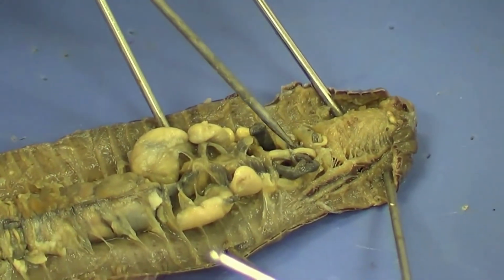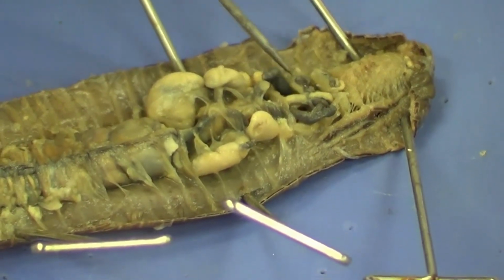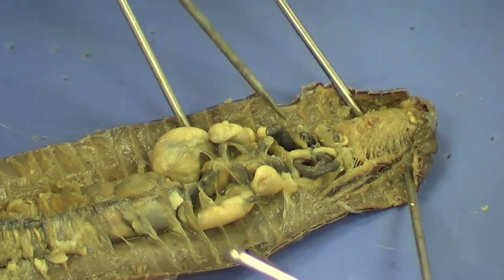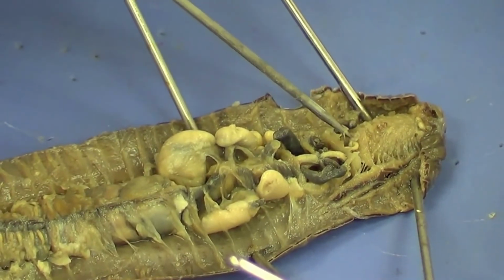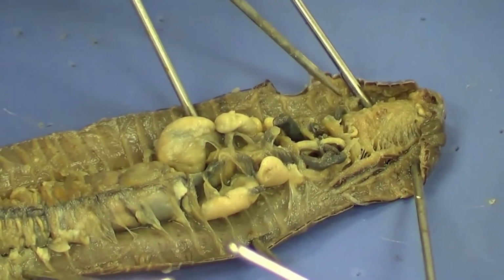And you can see another one here, another one here. And when you tease these, kind of tease across the worm like this. You don't want to go this way because you'll just rip them in two. So you want to kind of go this way. And maybe if you can get underneath one, lift it up just a little bit, just as I did there. You can see another one come into view. That's all you're going to get.